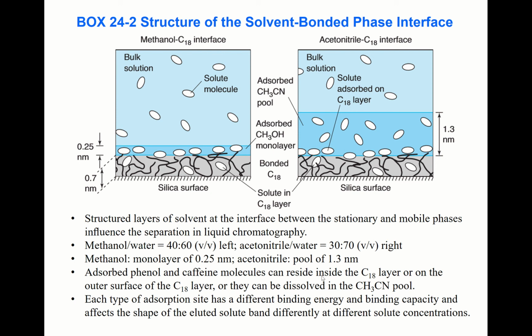In acetonitrile, not an acetonitrile monolayer, but an acetonitrile pool. Adsorbed phenol and caffeine molecules can reside inside the octadecyl layer, or on the outer surface of this octadecyl layer, or they can be dissolved in the acetonitrile pool here. This figure illustrates that.